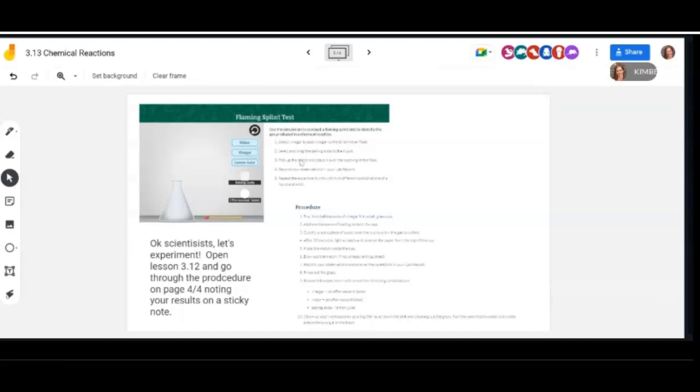So testing this on your own in the lesson using the simulation, you are able to see what happens if you add vinegar. If you start up here at the top, it says to add vinegar to the Erlenmeyer flask. So you click vinegar and it pours it in. So if we were to look at that, I think I have to share it in a different way.